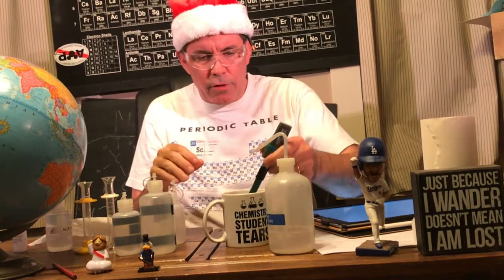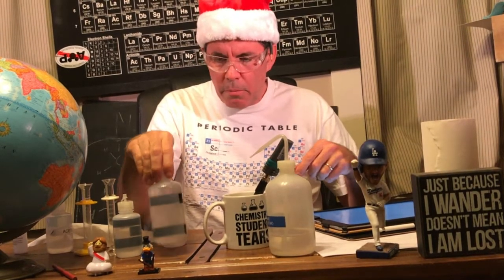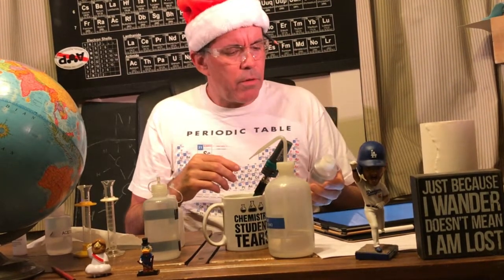Okay, so the first thing I'm going to do is fill a well with 0.1 molar acetic acid. But the problem is the 0.1 molar is still on campus. I only have 1 molar. So what should I do? Oh, I could dilute it.